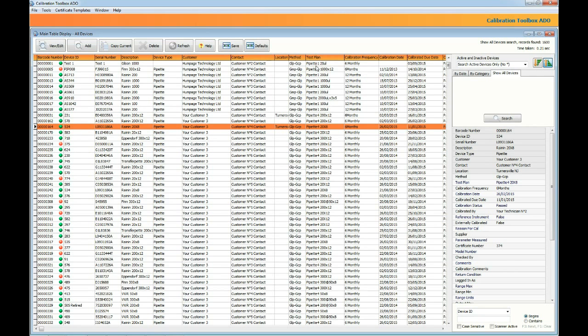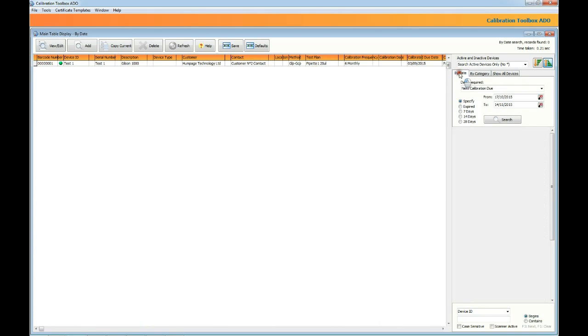The barcode number by the way is an automatically generated system tag. You don't have to worry about that, the toolbox takes care of it for you.